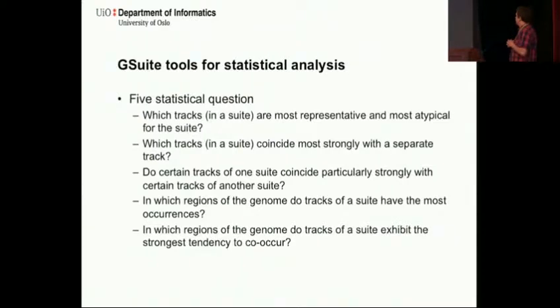When having 2 GSuites or 2 collections of datasets, you can ask the question: are certain tracks of one suite coinciding particularly strongly with certain tracks of another suite?